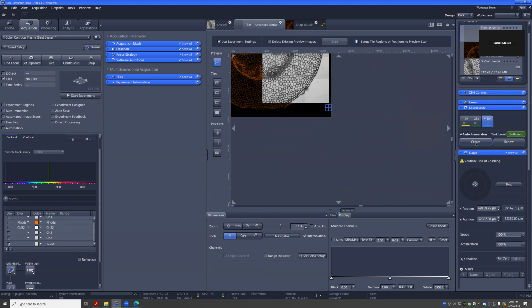So it should be a standard volume. So there's no change here. But there's two different volumes here. So you see how it says renew versus create? Create is like a larger starting volume, where renew is smaller, to add more to existing. So what is the volume of create? I don't know the exact one.